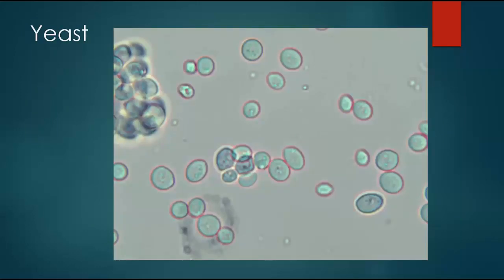The organism that we'll be studying this week is the same as we've been using for a few experiments this semester: the eukaryotic fungus known as yeast. The single-cell fungus has most of the same organelles that your cells have, and it's an organism that is easy to grow in the lab and respires quite readily.